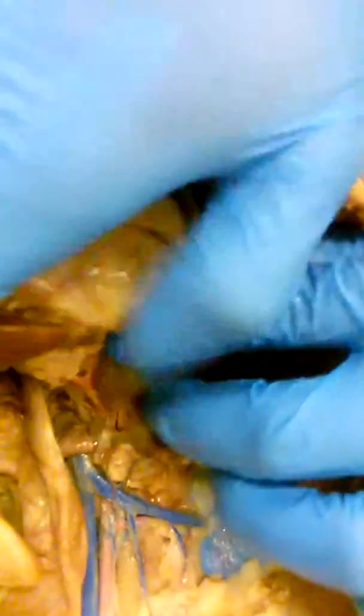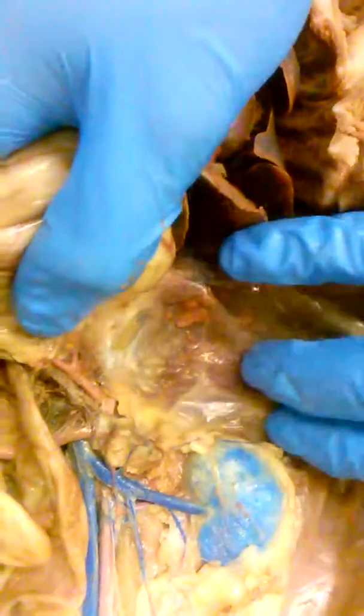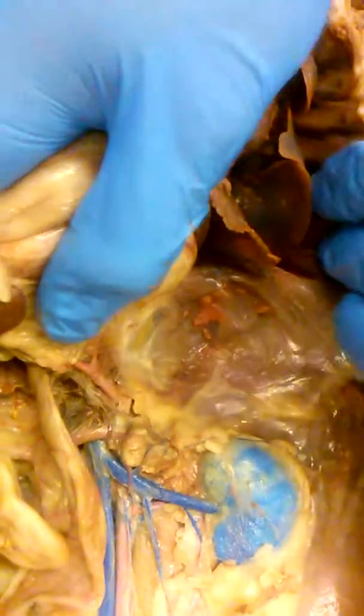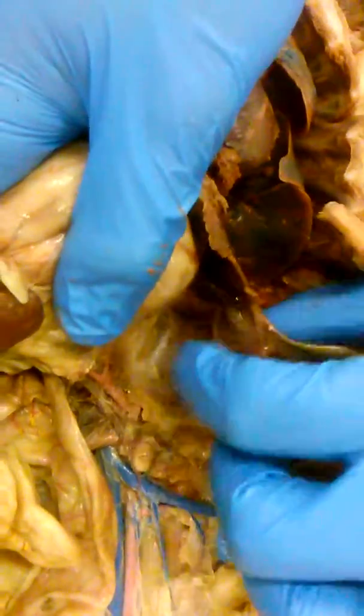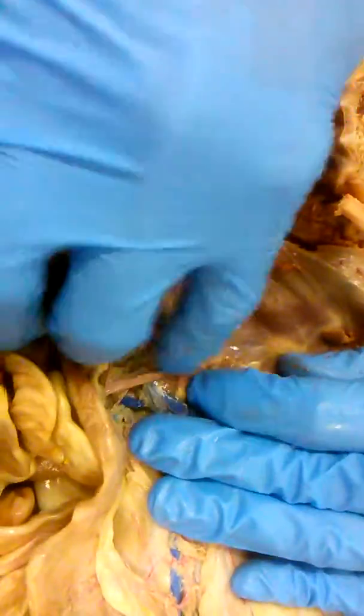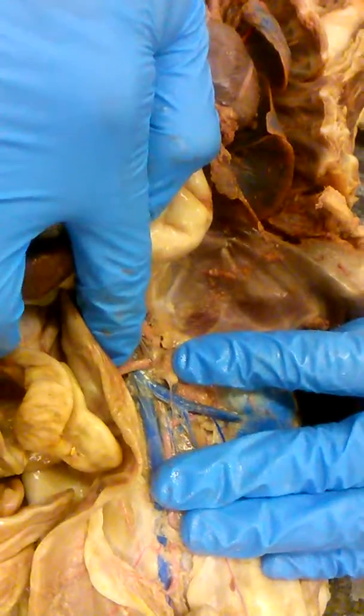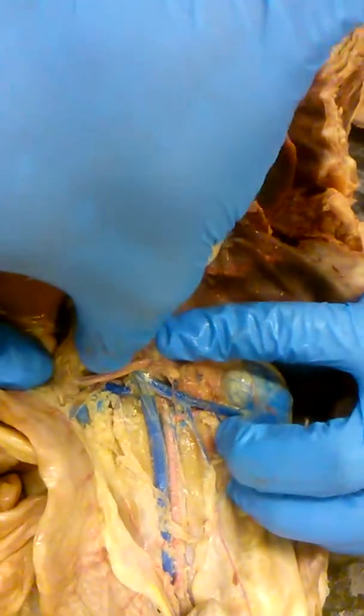Can you pull that open again, please? Yep, right there. You can see it starts to split, but it's going to split into 3 different arteries. It's going to go to your spleen, your stomach, and liver. The next one, right under it, and they're close, so you have to remember it, is the superior mesenteric artery right here. That's it? Yep, right there.